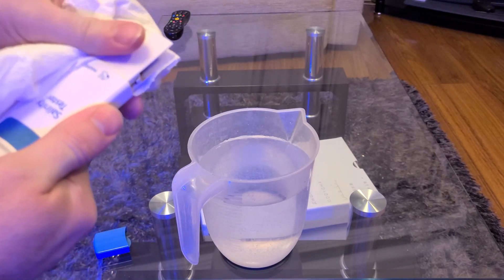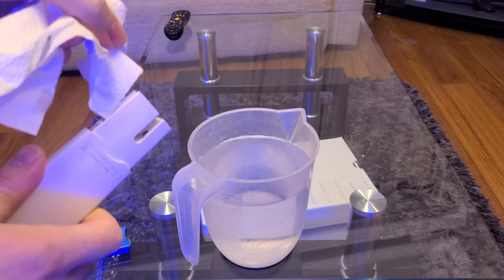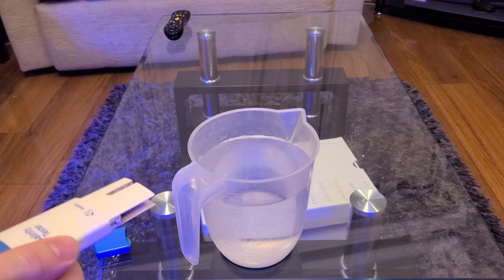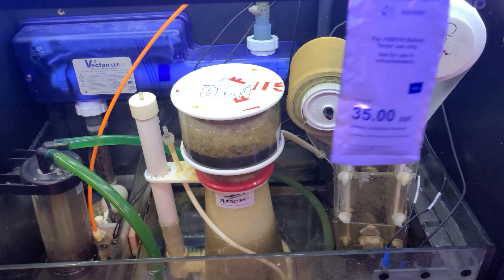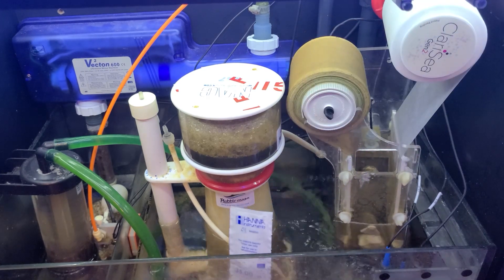The next step isn't really required because the device has built-in temperature compensation. But I just like to float the calibration fluid in my sump to get it to the same temperature as the water that I'm going to be testing, and then leave the device to dry for a few hours.